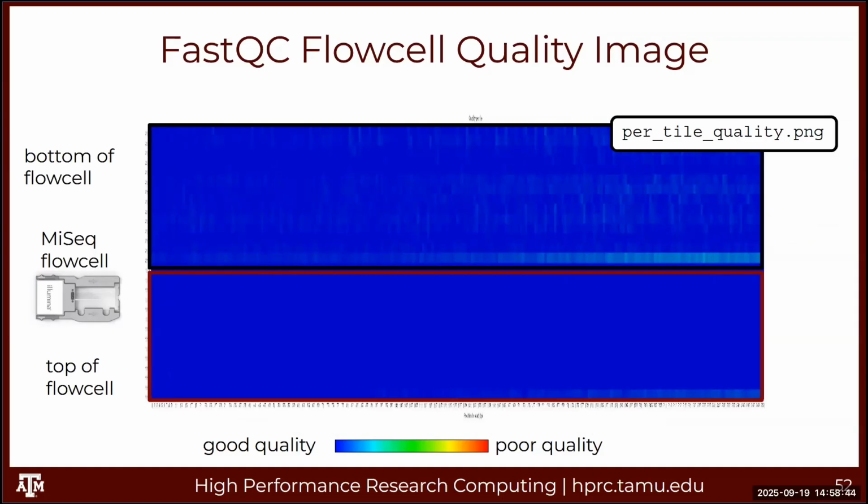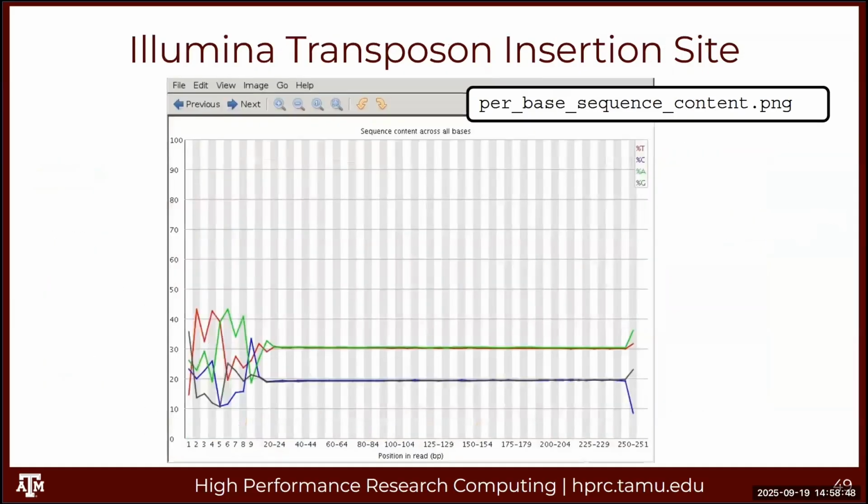Question. Illumina transposon insertion site. If we go back to this picture, for the first one, can we use this data? So you can use that data.